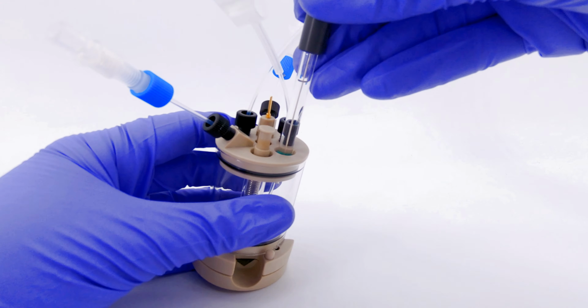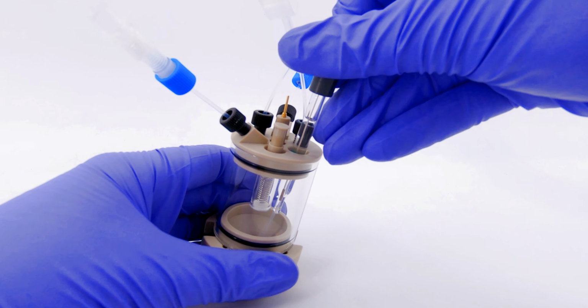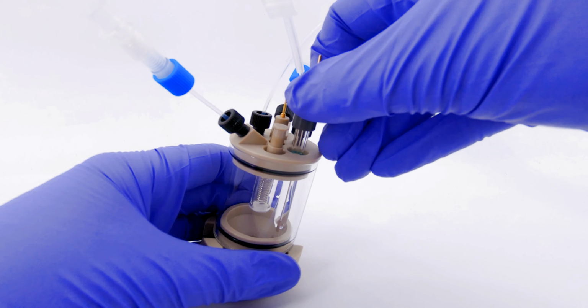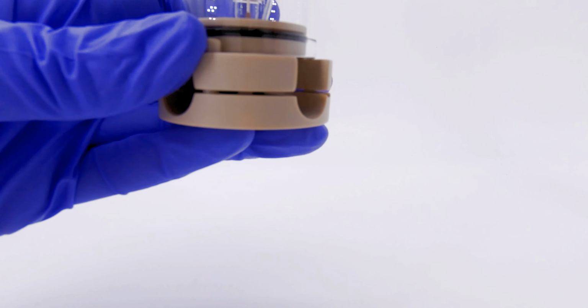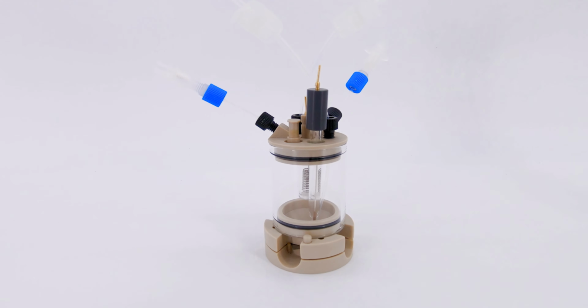Remember, it might be a snug fit, so it's essential to avoid damaging the electrode. The reference electrode should be placed a few millimeters away from the working electrode. Voila! Your cell is now primed and ready for your scientific explorations.